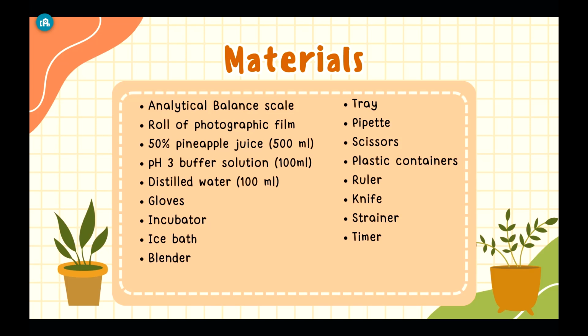The materials include the analytical balance scale, photographic film, 50% pineapple juice, pH buffer solution, distilled water, gloves, incubator, ice bath, blender, tray, pipette, scissors, plastic containers, ruler, knife, strainer, and timer.